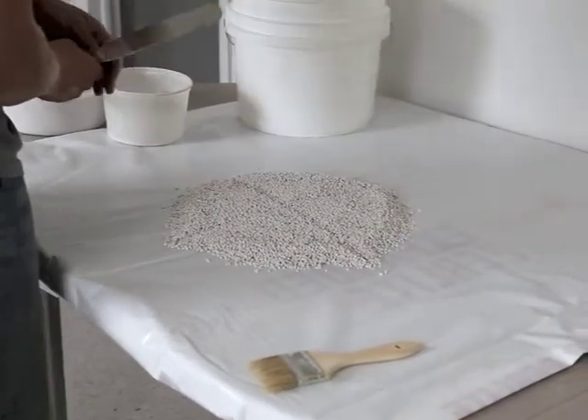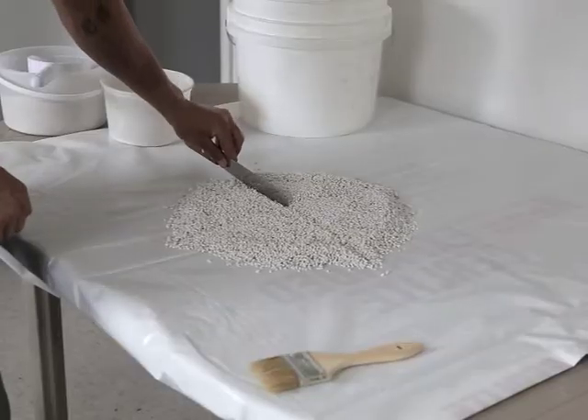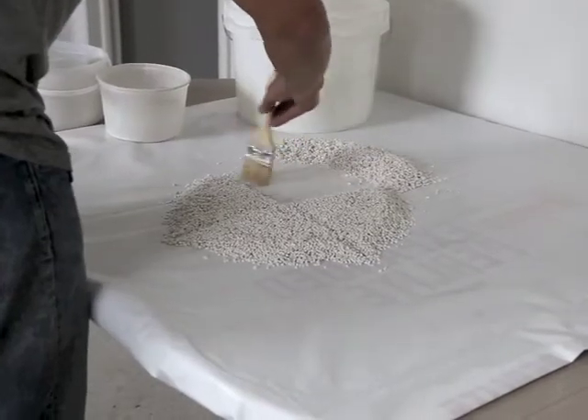Mark the flat circular pile into quarters and reject two opposite quarters. Make sure to collect all fines.